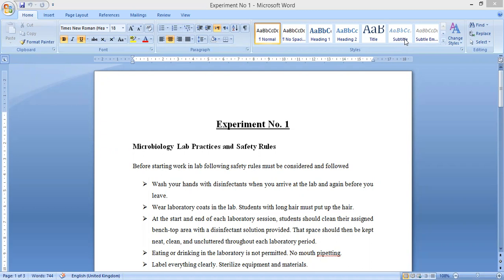Bismillah ar-Rahman ar-Rahim. Assalamu alaikum my dear students. I am your instructor for the subject biological techniques, Dr. Aisha Rashid. Today I am here with lab number one, which has the title: microbiology lab practice and safety rules.